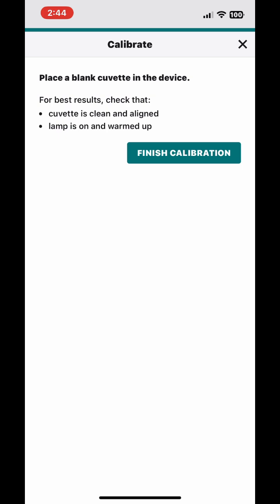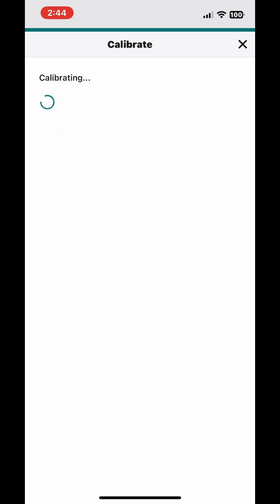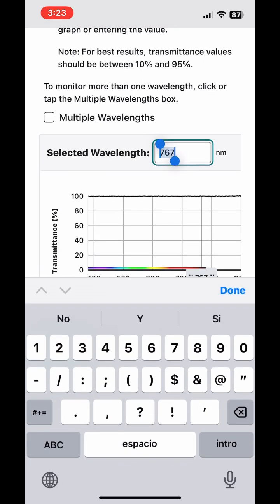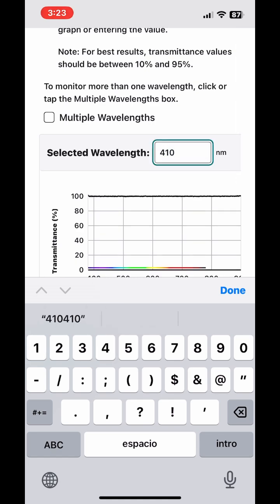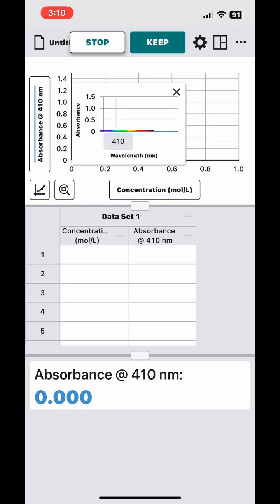Then you have to calibrate your lamp, and you just do this by taking a blank, which is basically a cuvette filled with water, and you put it in so it calibrates, and when it's all in and aligned, just press finish calibration. You then choose the wavelength of light you're going to use for your experiment based on which wavelength will get you maximum absorbance. I'll be using 410 nanometer light for this demonstration.